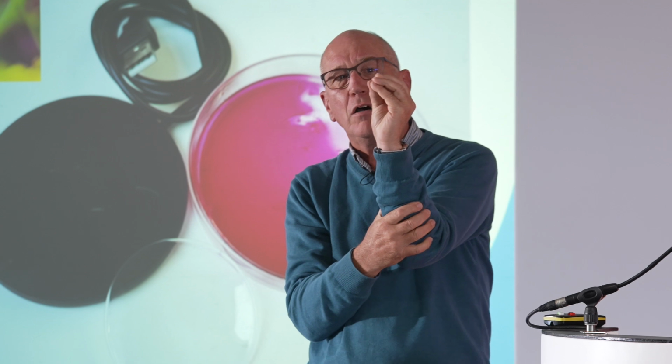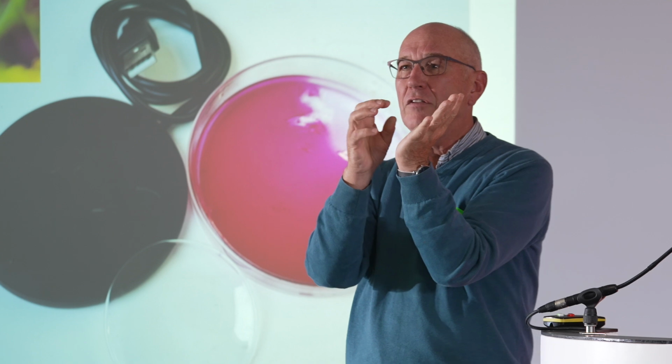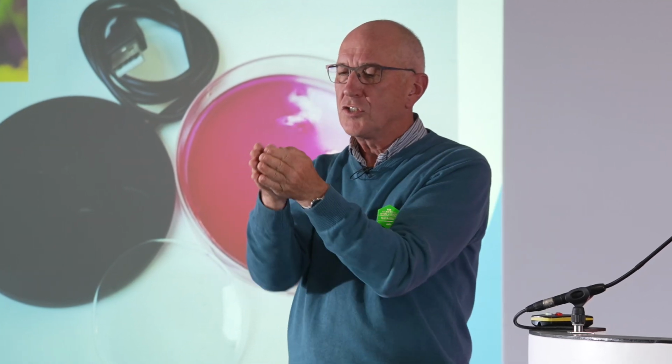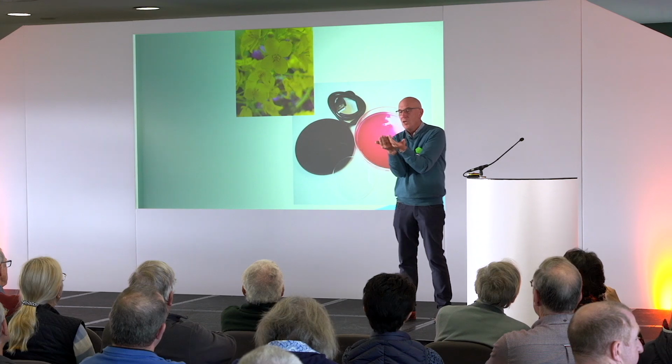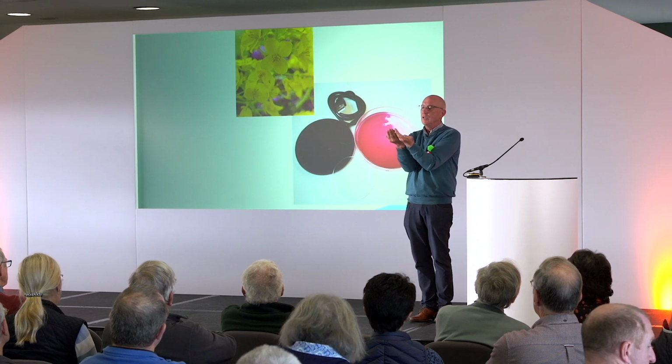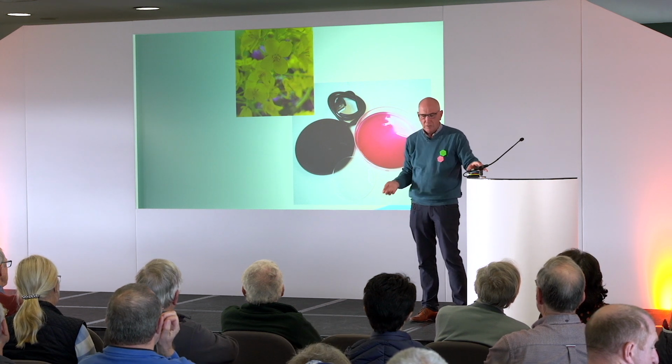So if you take a flower which is closed, put it in a window and let the sun open it up, then you allow the anthers to dehisce. So an anther is something like this, and it dehisces. And when it dehisces, the pollen's then exposed, and then you can use that for making your pollen slides. Then you know you've got an unadulterated flower or anther for your pollens.